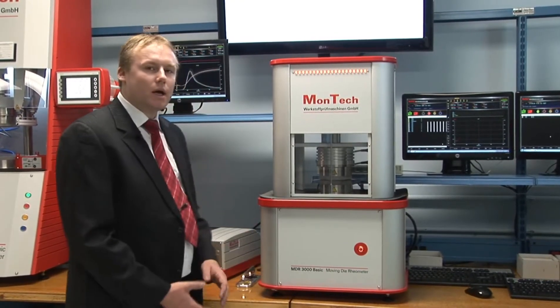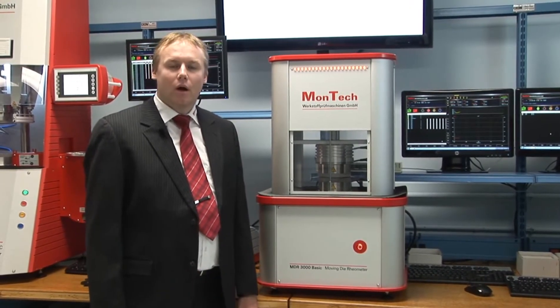Here you can see the MDR3000 BASIC in its standard configuration. Of course you can add options to this instrument, like pressure measurement to measure not only torque but also the pressure in the die cavity.